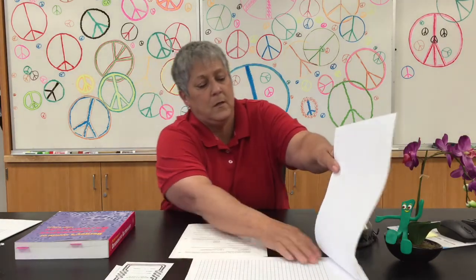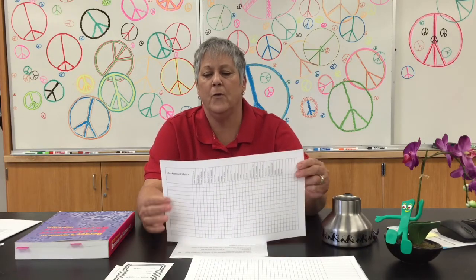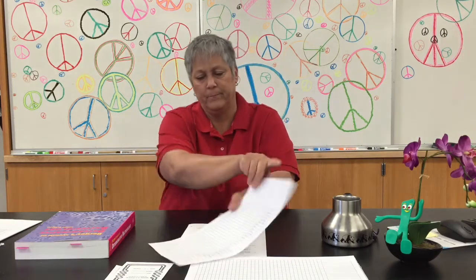What you'll do at this point is you'll be given one of these papers right here, and this is called the Checkerboard Matrix. Now, the column here on the left is where you're going to write down the names of the organisms that were on that bug list that you were given earlier. And then you'll see the names of a number of biochemical tests on the top. What you're going to do is you'll go to the library and you're going to do your best to fill in this checkerboard matrix. Now, some cautions.